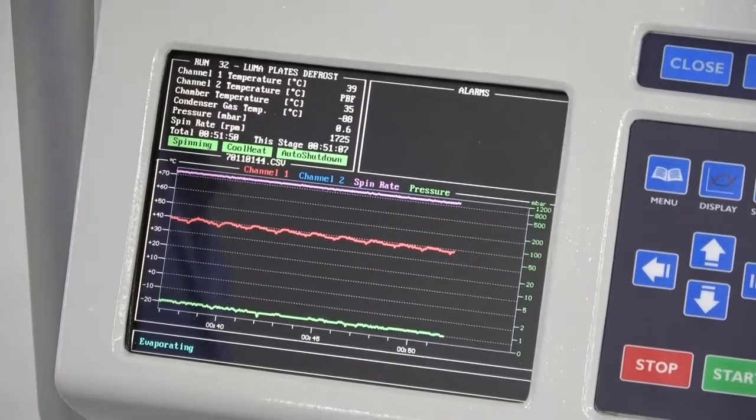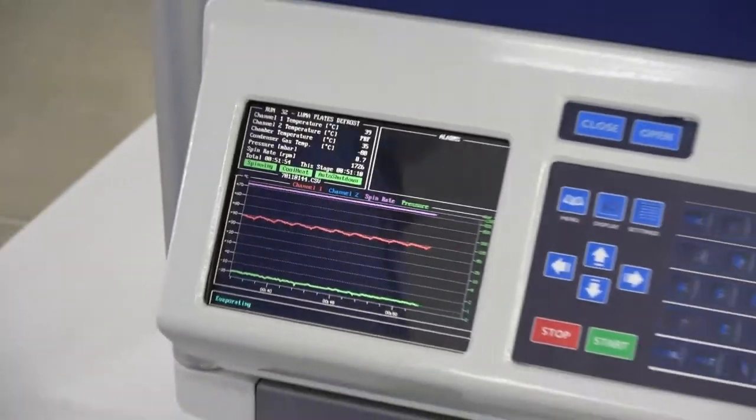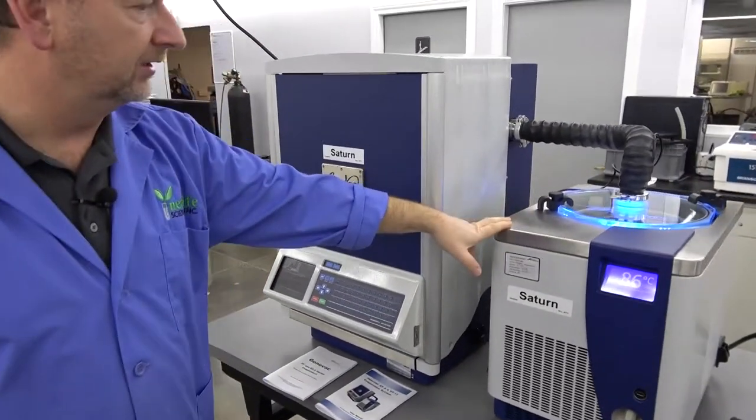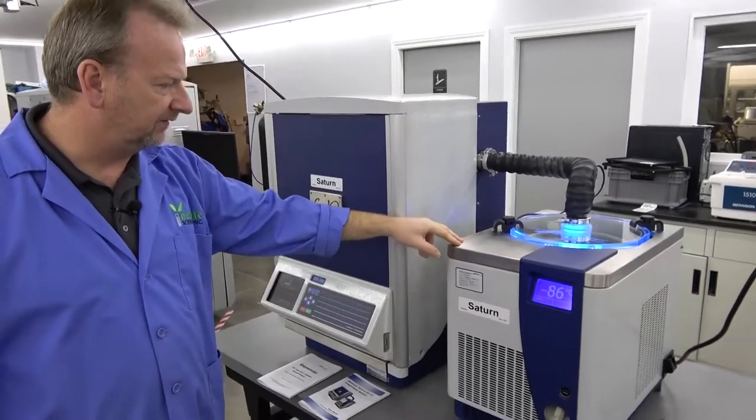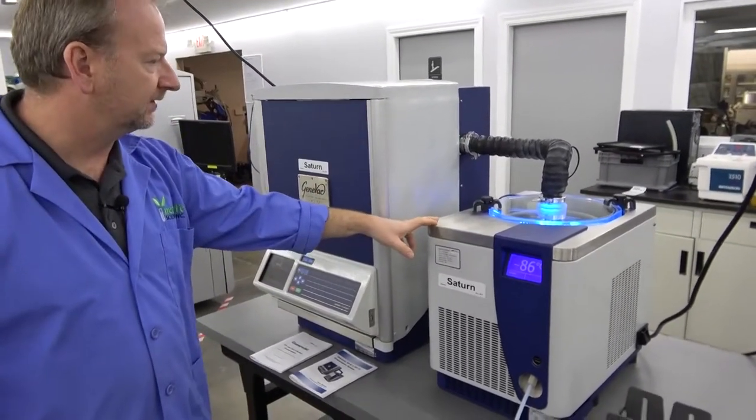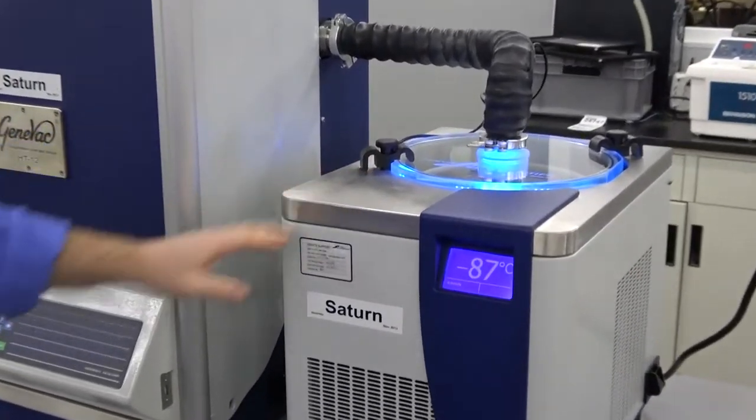We're going to be powering it down so we can get some shots of the inside here in a little bit. But like I said, it does have the upgraded condenser here to get the extremely cold temperatures so you can evaporate those real tough solvents out there. But just look how nice this thing is. Just a beautiful machine.